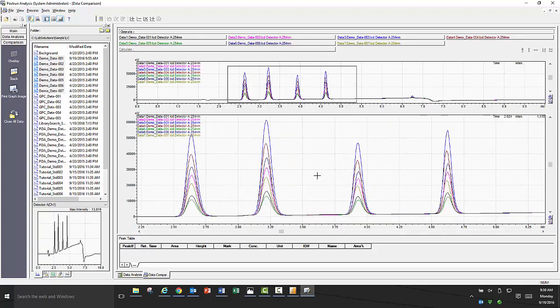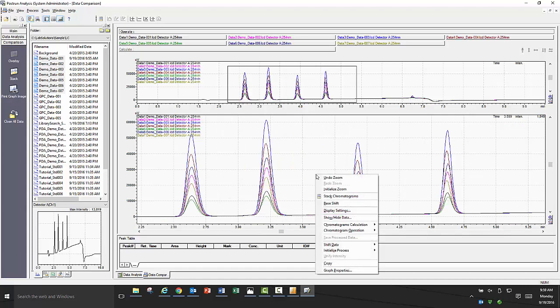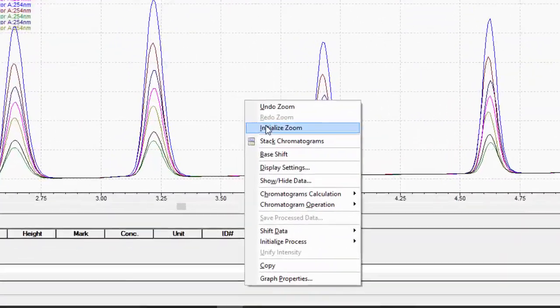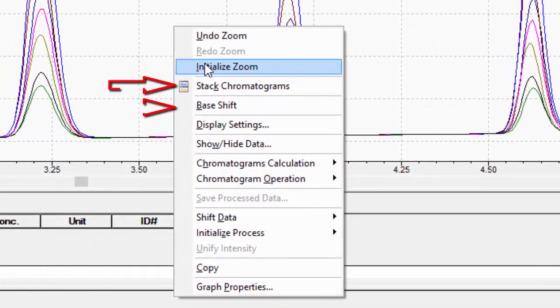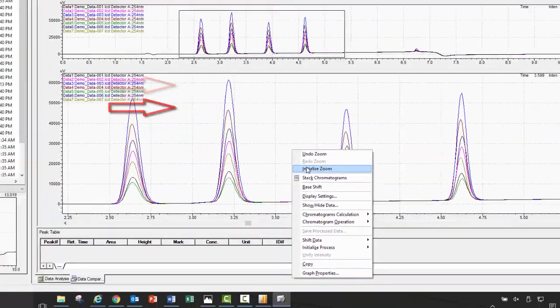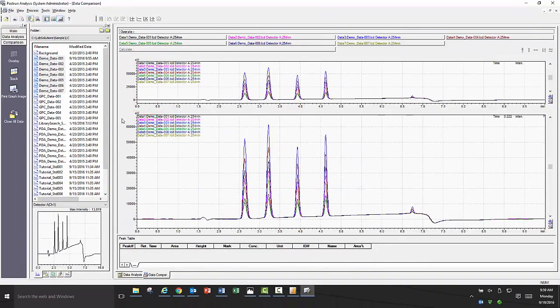Once you have the files open you would like to compare, there are additional options for viewing the chromatograms where either they are overlaid and share the same baseline as seen here, are vertically stacked separately, or you can also overlay and base shift the chromatograms to offset each baseline.